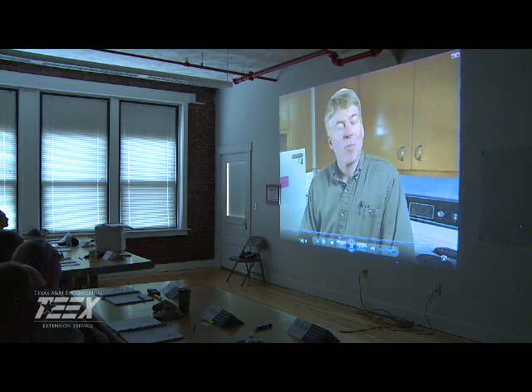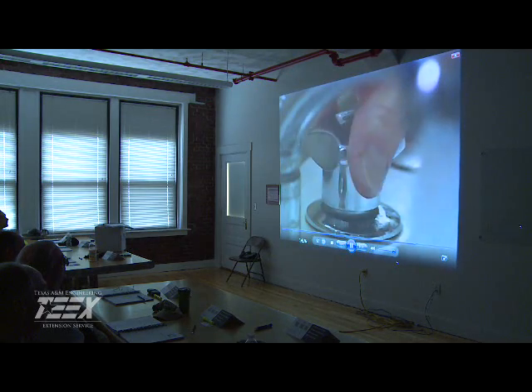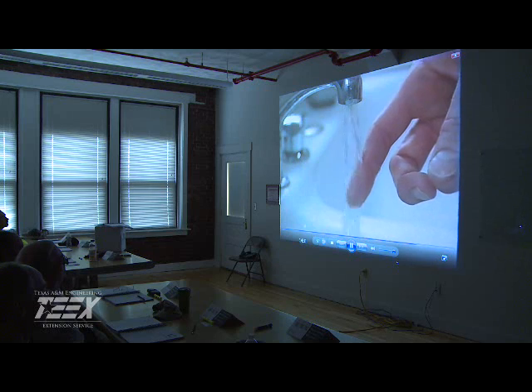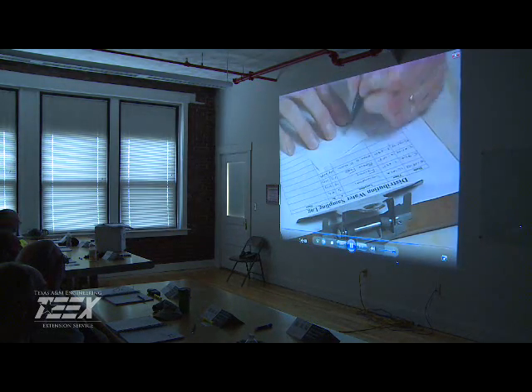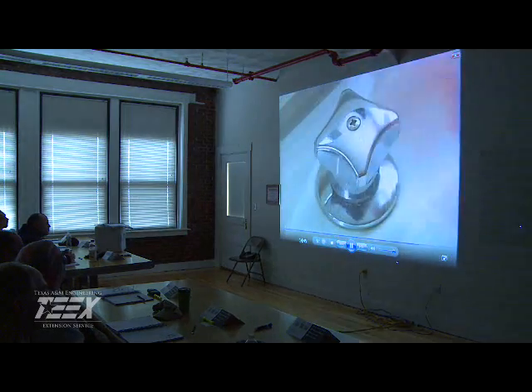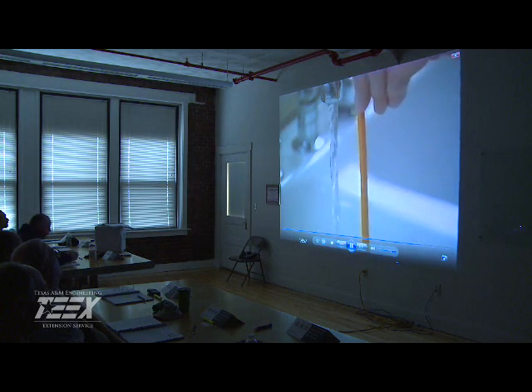Now open the cold water tap. Monitor the temperature and let the water run until the temperature stabilizes. It's also important to clear the service line, so let the water run for 2 to 3 minutes. It's a good idea to time this step. While you're waiting, fill out the label, tag, and lab form using waterproof ink. Now adjust the flow. You want a stream that's about 1/8 of an inch in diameter, about the width of a pencil. Check for steady flow and don't change the water flow once you have started sampling. That could dislodge microbial growth.